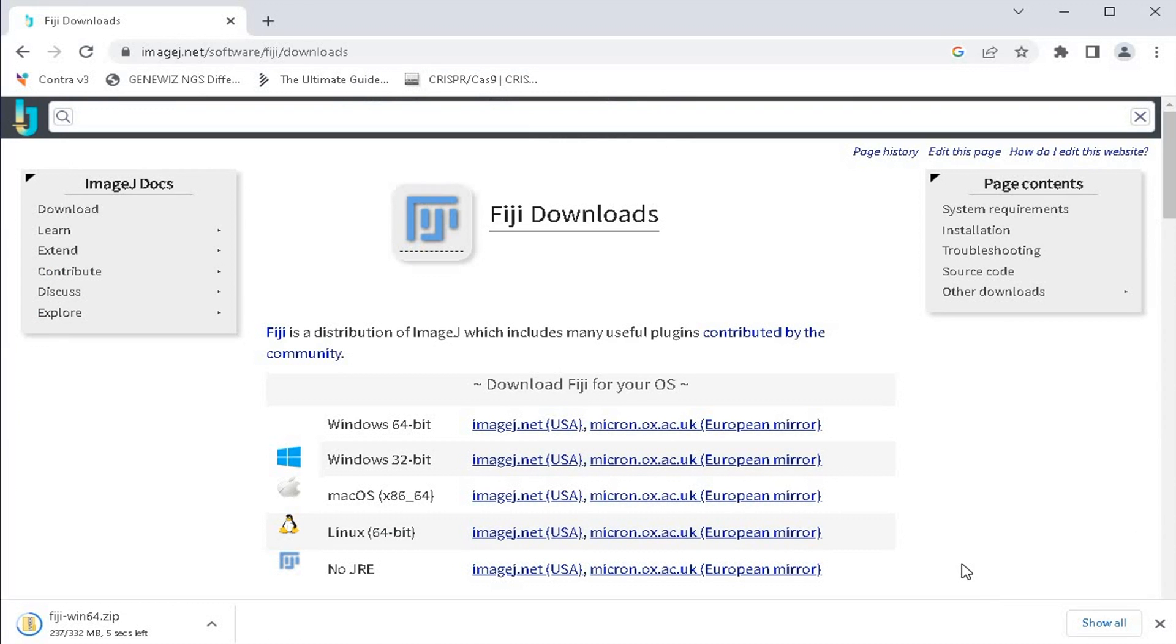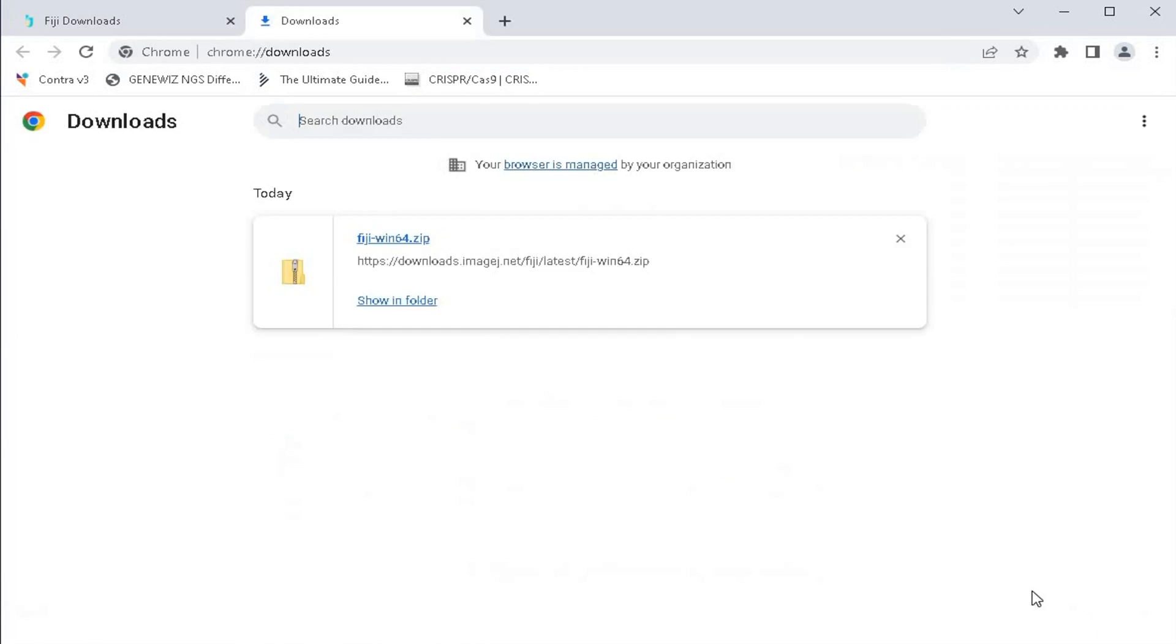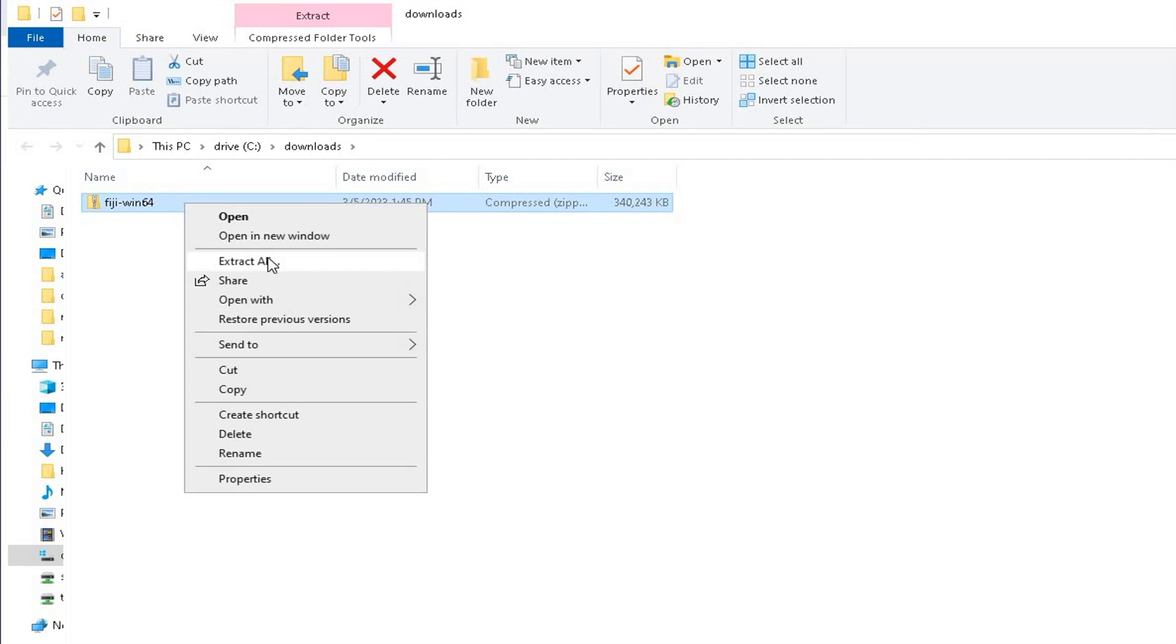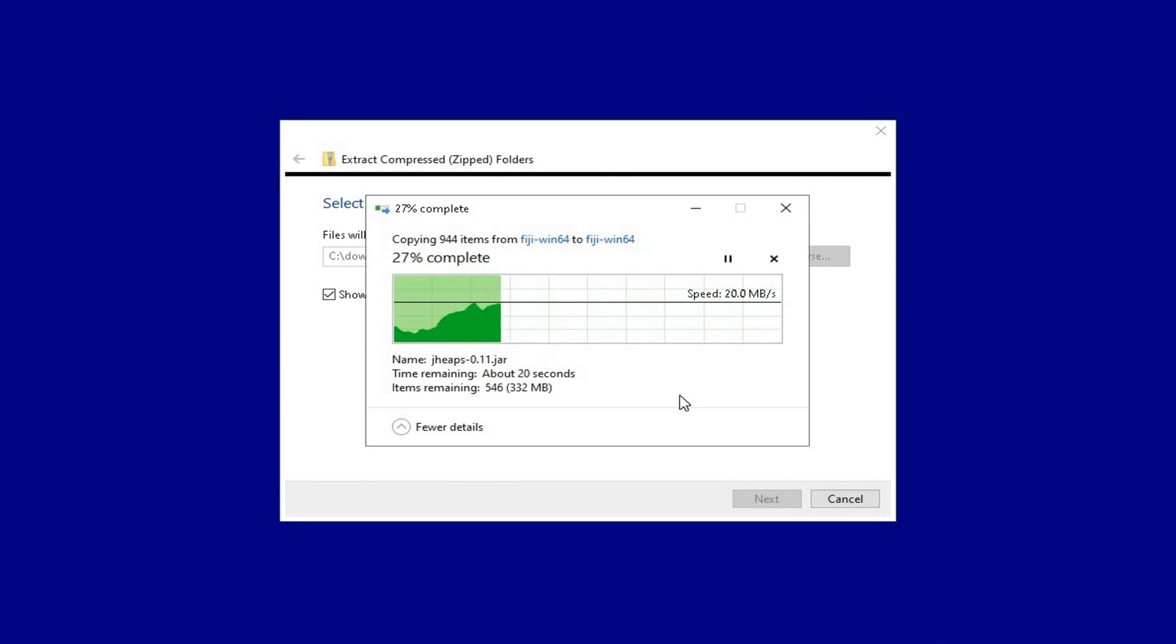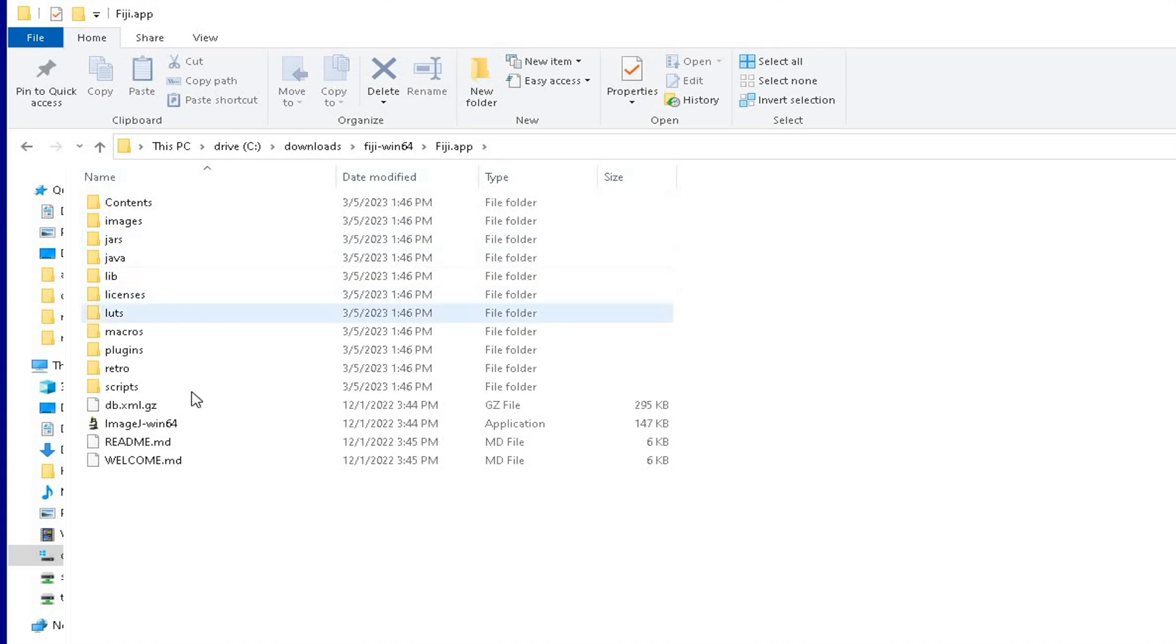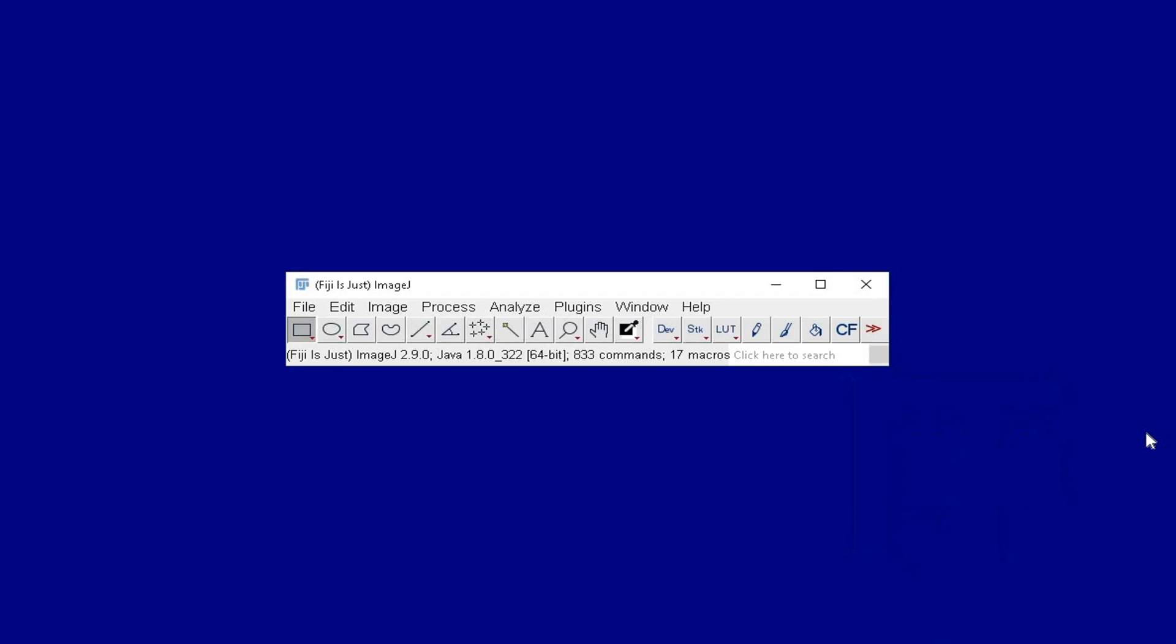Once download is complete, locate the file and extract the compressed Fiji file. Double click on the extracted folder and locate Fiji icon. This software is now ready to use.